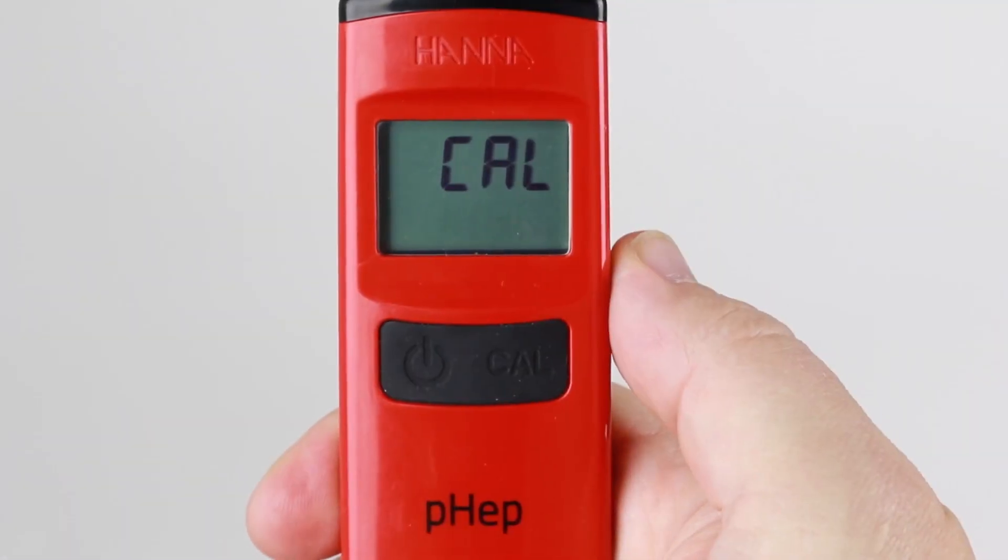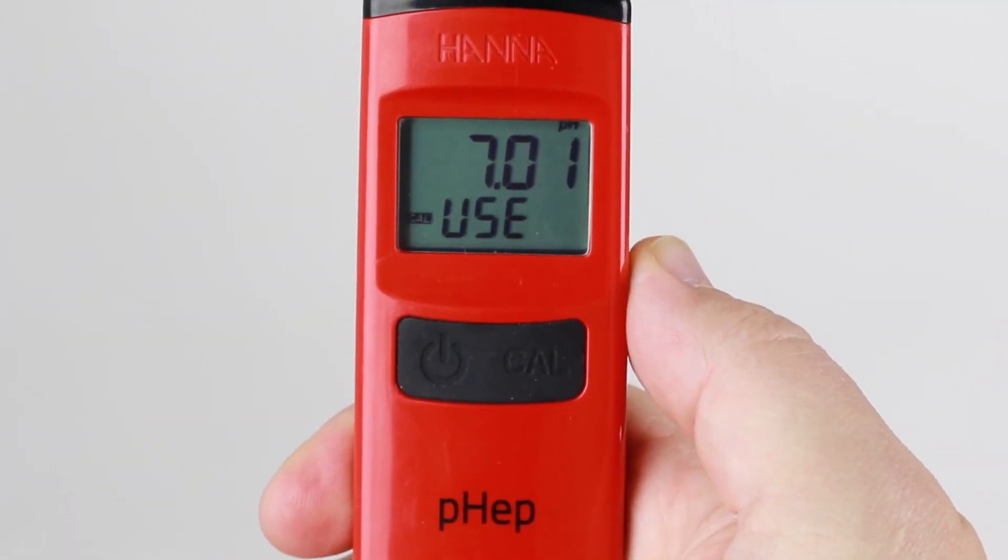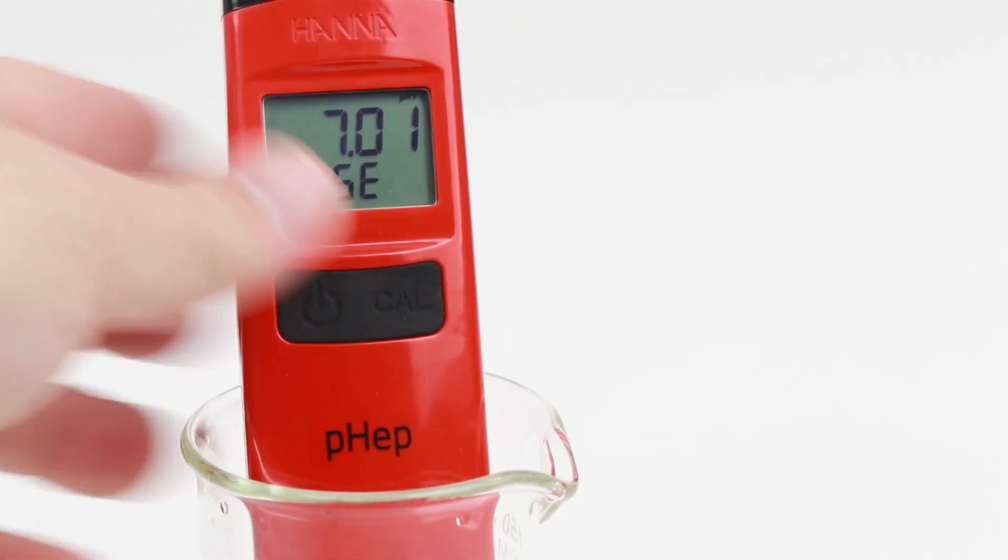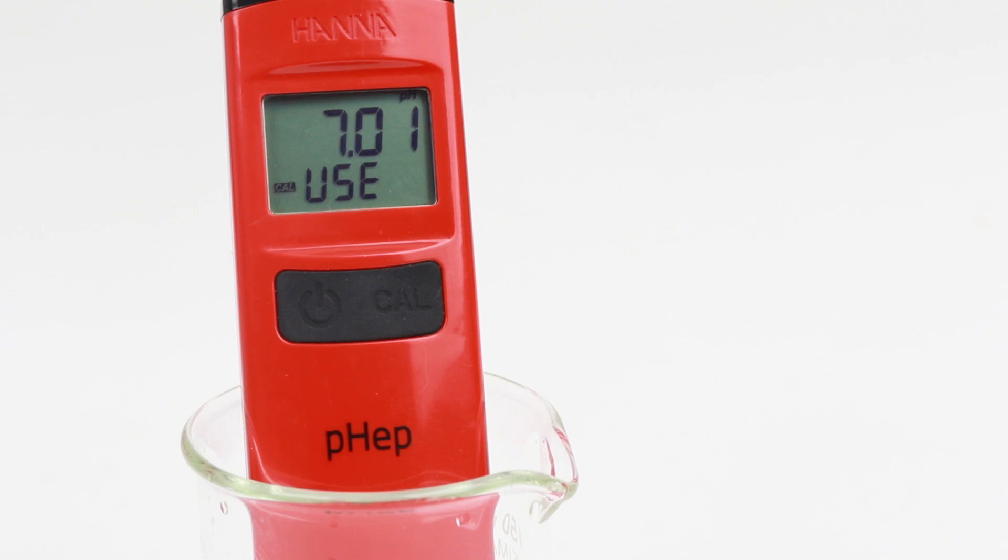To calibrate the meter, press the CAL button while the meter is on to enter calibration mode. For two-point calibration, the meter will prompt for the pH 7.01 buffer. Once the buffer is automatically recognized, the buffer will be updated and REC will be displayed and the meter will then display pH 4.01.